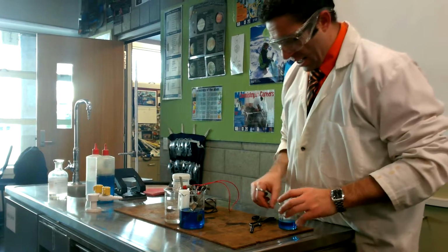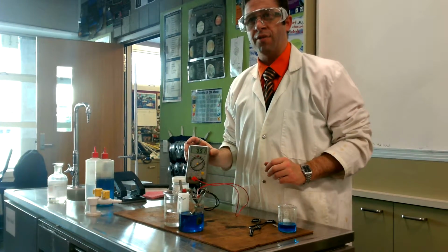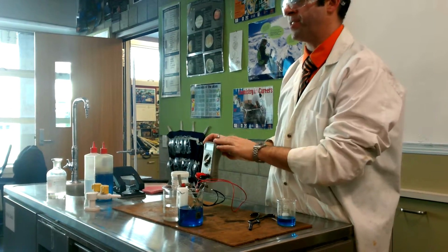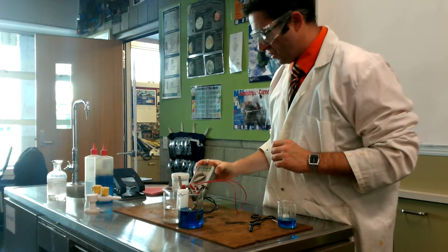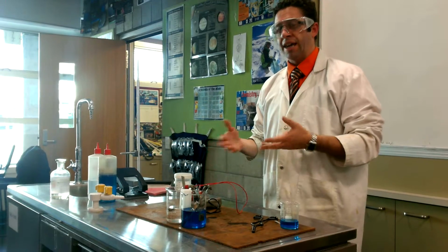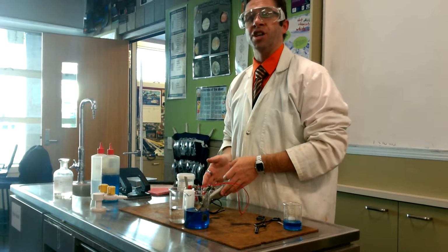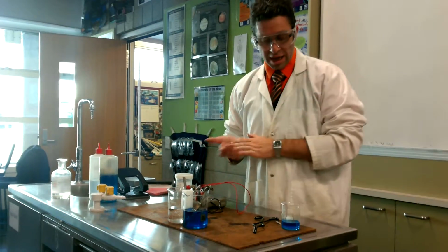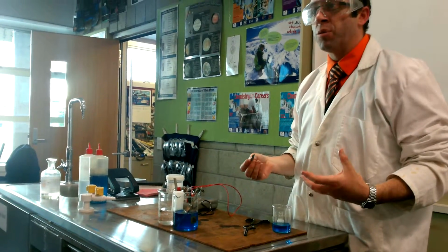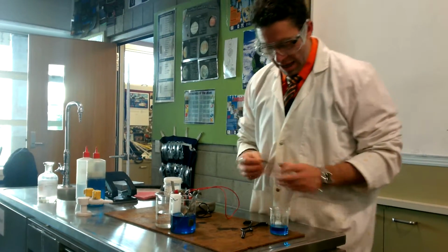You'll notice I have no power source here, okay? And yet, if I hold this up, I've got about 0.9 volts being shown on the voltmeter. I've set this up as a voltmeter. Alright, so there's no power source here. That means that a chemical reaction is creating a voltage, so an amount of energy per coulomb. That's what that E0 value that we've been working with actually means. It's measured in volts or joules per coulomb.